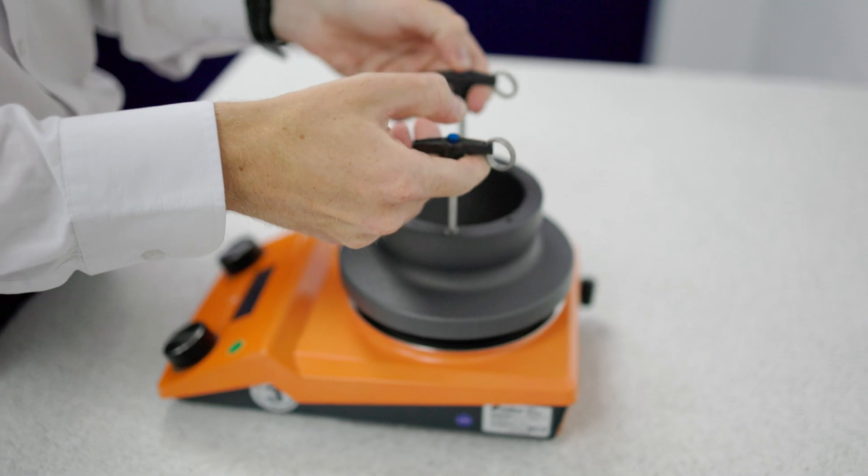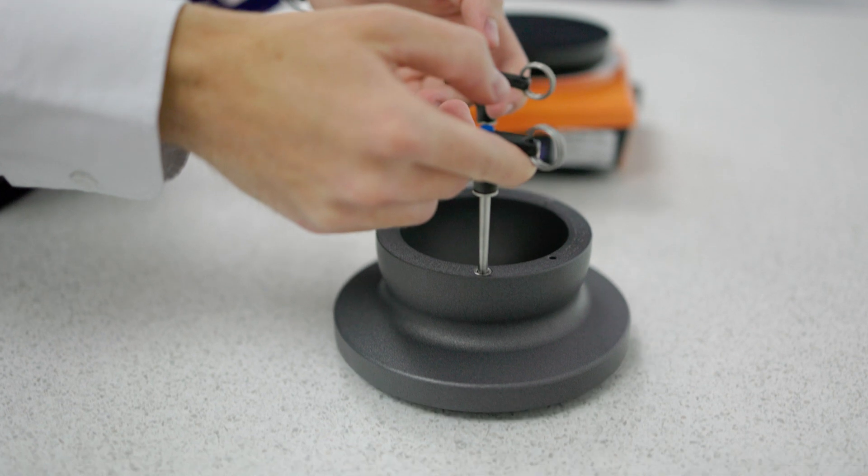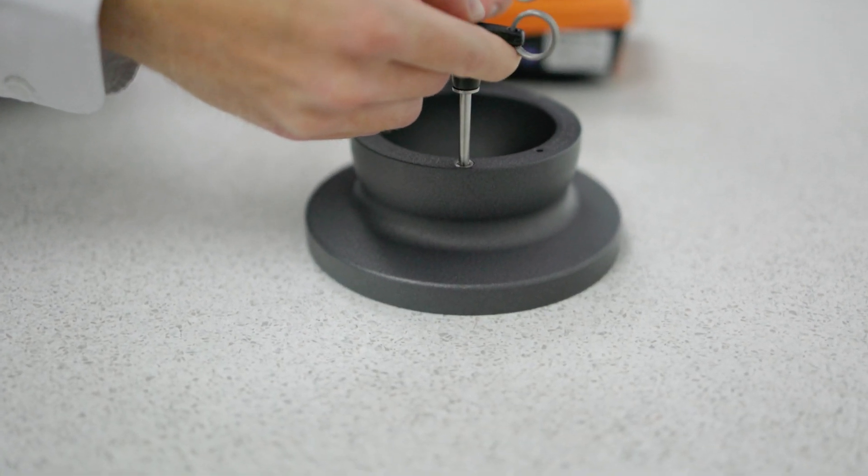You can use lifting handles — these are optional — to move the block when it's hot from the top of the hot plate if you need to. They work with all the large flasks and also the small and multi-well holders.